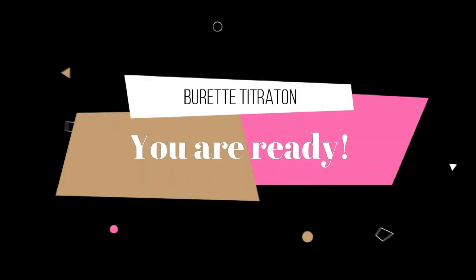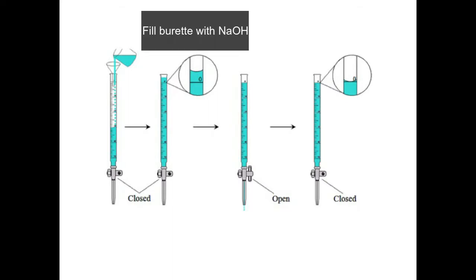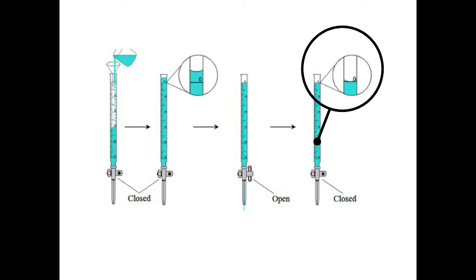You can repeat this process one more time to ensure the burette has been thoroughly rinsed and contains only our solution inside. Now we are ready for titration. We will put sodium hydroxide solution into the burette to the 0.0 mark. We do this by carefully filling it up until the solution passes the 0.0 mark slightly, then turning the stopcock very slowly to let it drain until we reach the 0.0 mark.